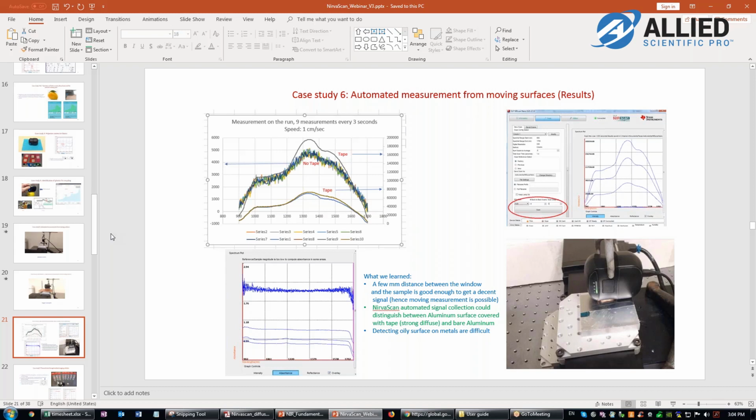Right. But one possibility, I don't know if you're interested in this or not, is that you could send us a sample of your powdered asphalt, and I could do a quick measurement and look at the spectrum. I can send you the spectrum, and then you can look at that. You talk about non-destructive testing. So my question in terms of this particular application: can I take the device?